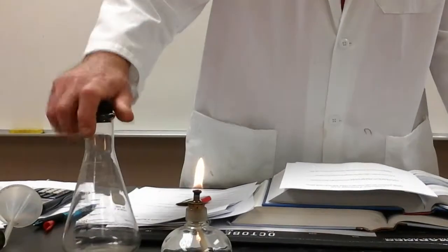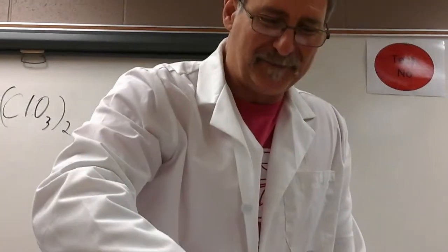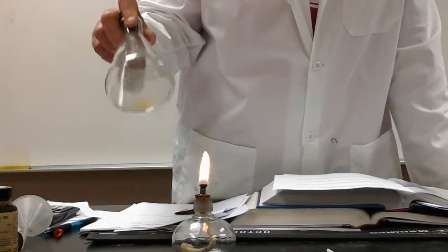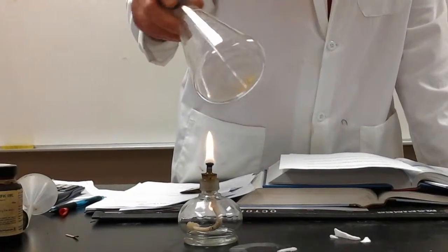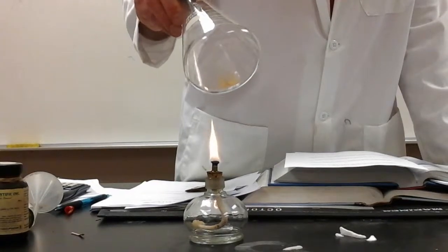It's also purple, if you can catch that or not. It's kind of purplish. You probably can't, can you? No, it doesn't show up real well. Now, when I heat it up, iodine, like carbon dioxide, also sublimes, not at room temperature though. It doesn't take much though, a little bit of gentle heating and, well, you'll see.